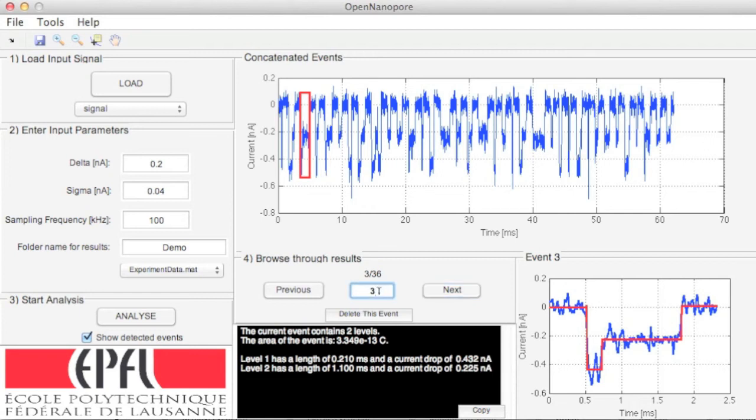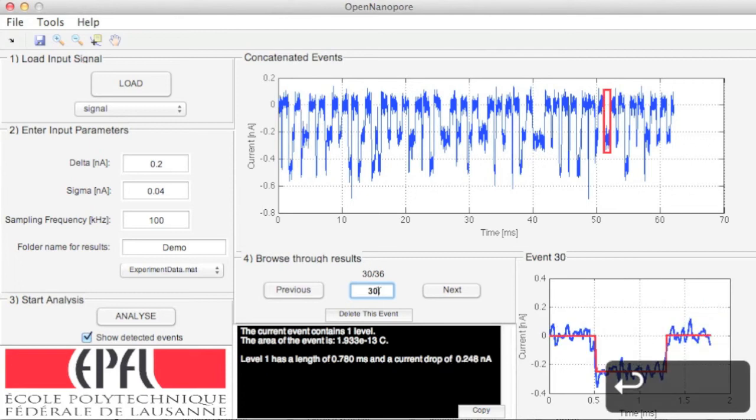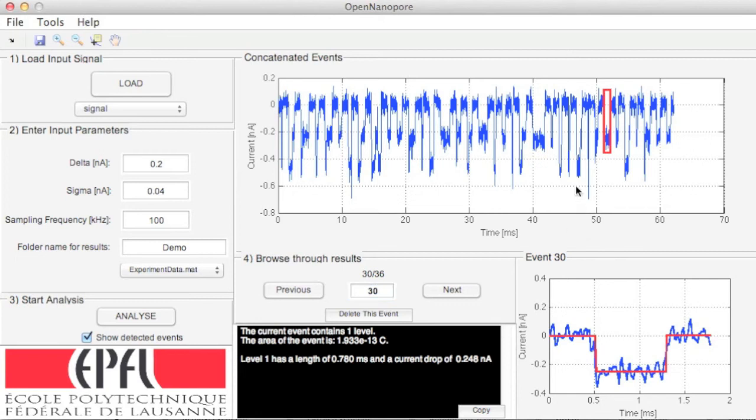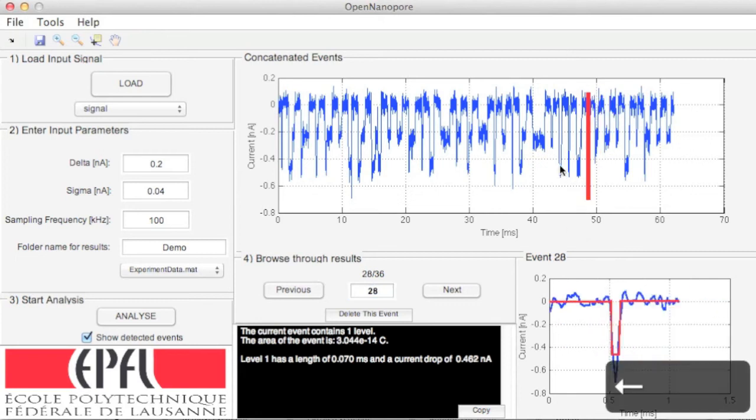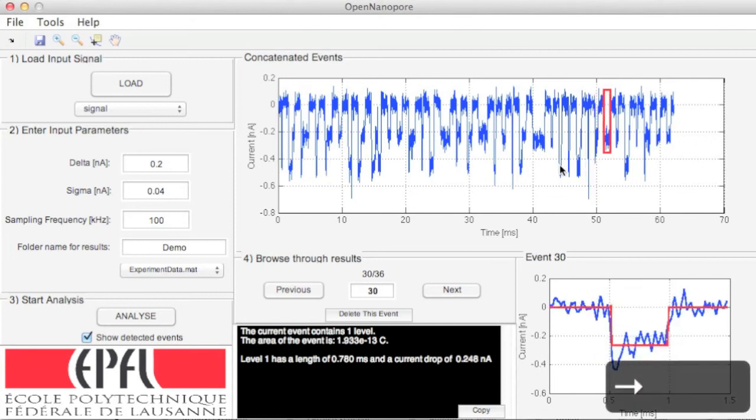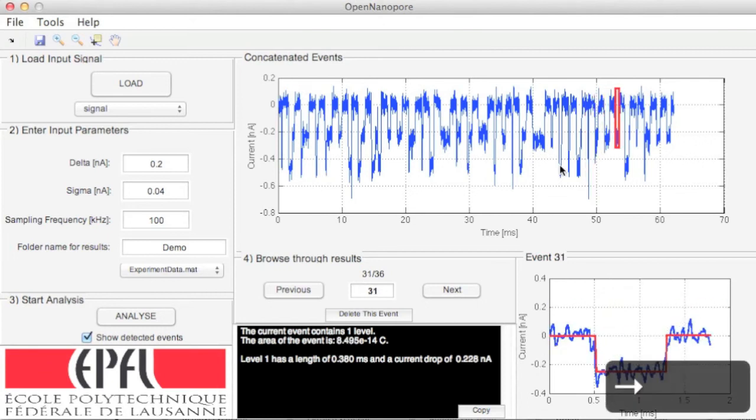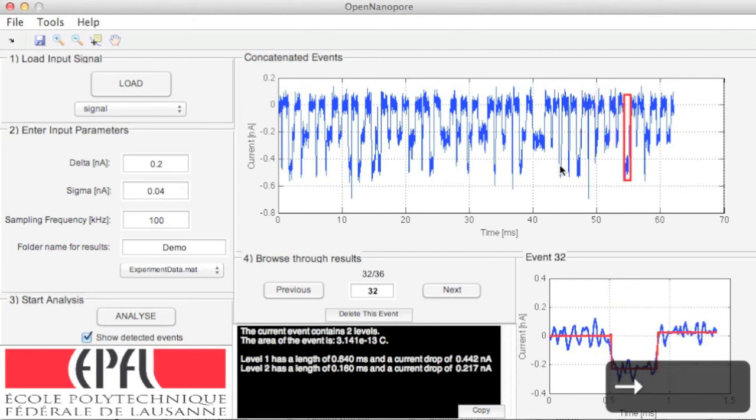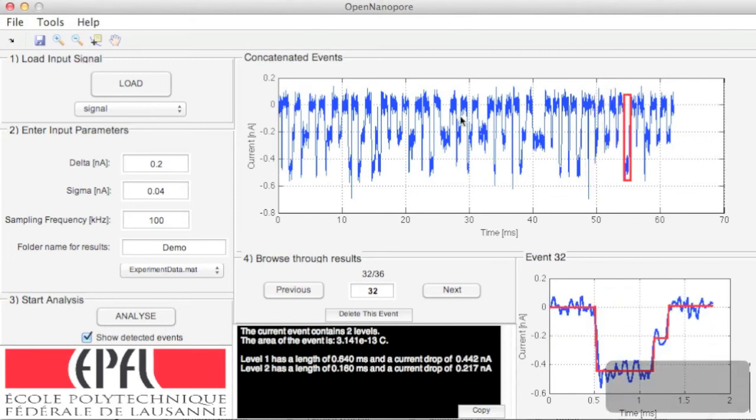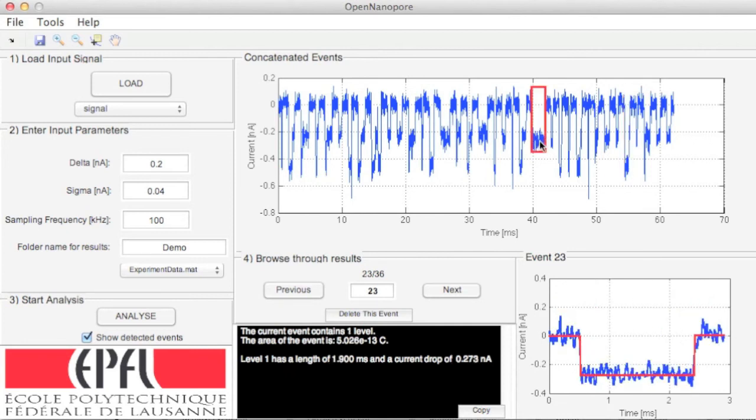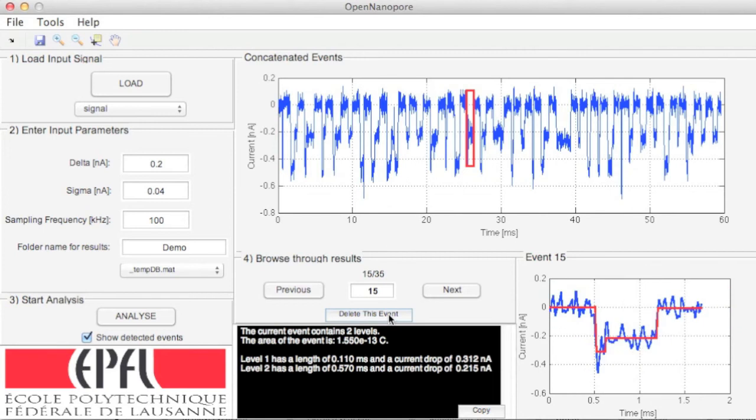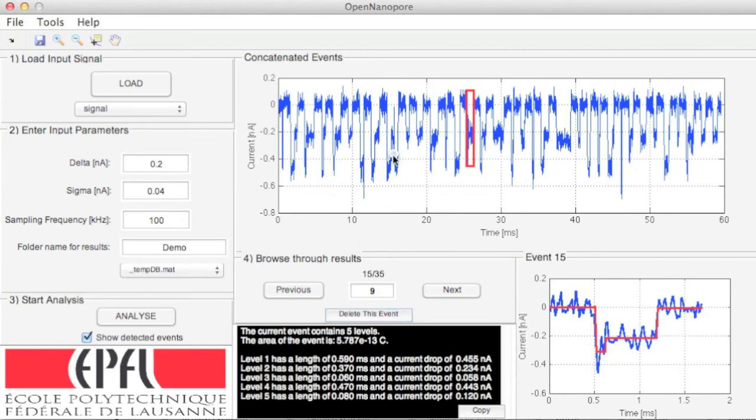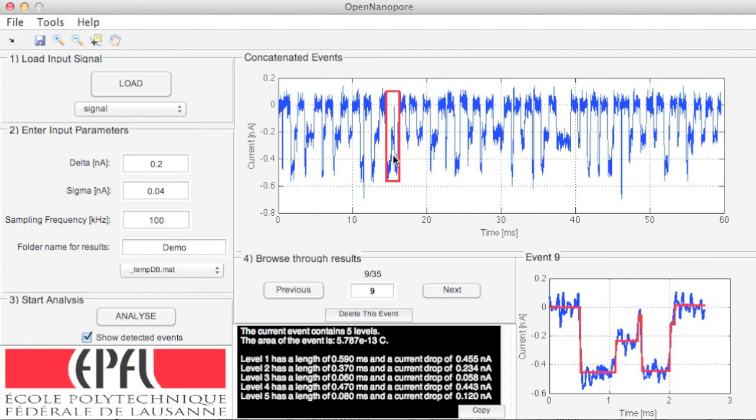Also, you can put in the event number directly or use the arrow keys on your keyboard. When you find an event that doesn't match, either because the fit is bad, or it is a very long event that you don't want to keep in your analysis, anything that doesn't fit your conditions can be deleted using the delete button or the backspace button on your keyboard.